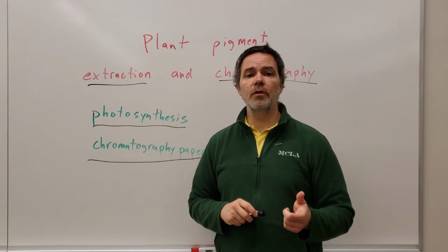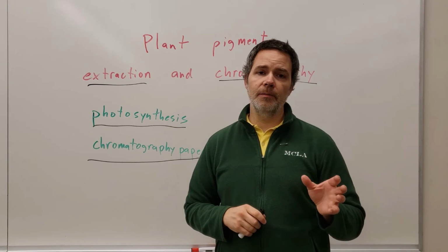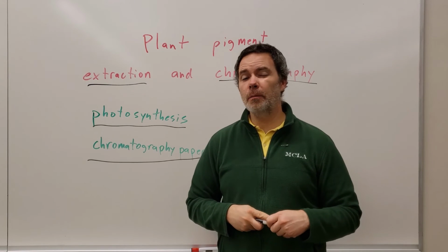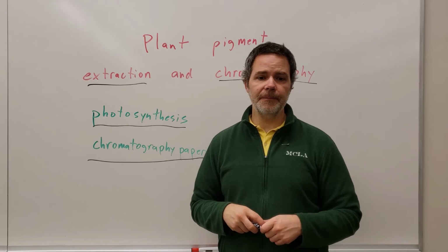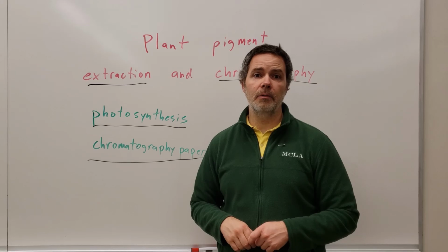So you're going to proceed through the lab. As you work through here, follow the different hotspots. Make sure you follow them in order, in numeric order on the screen. And there are a couple other things that you'll click along the way. Make sure you read everything, follow all the protocols, and acquire the results and fill those in on your lab worksheets.